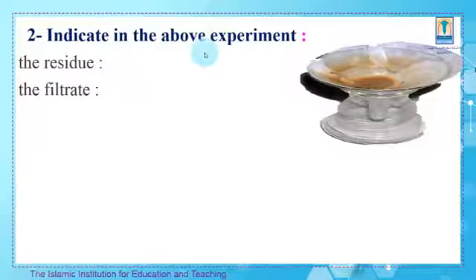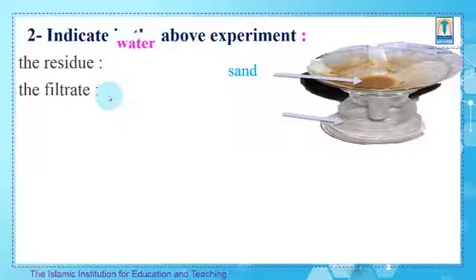Indicate in the above experiment the residue and the filtrate. The residue is the sand retained by the filter paper after filtration. The filtrate is the water recuperated after filtration.